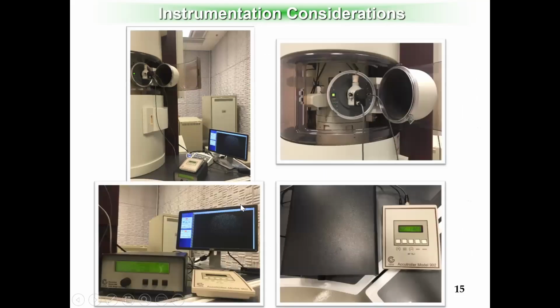I want to show a real image of how we do the cryo-TEM experiment, right? So this is in the UC Irvine facility. You can check it, it's called IMRI. It's open to all the UC members or even from industry. So if you are interested, you can just apply for usage. So basically, this is a cooling holder that we can pour the liquid nitrogen into. We just insert it into the column. So this is the microscope.